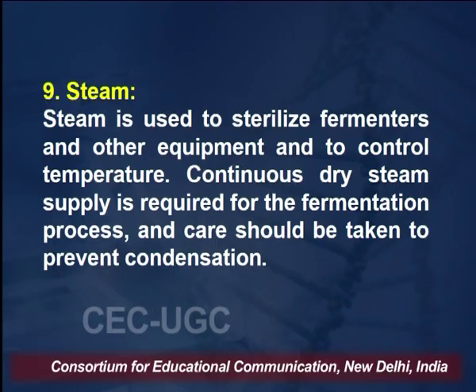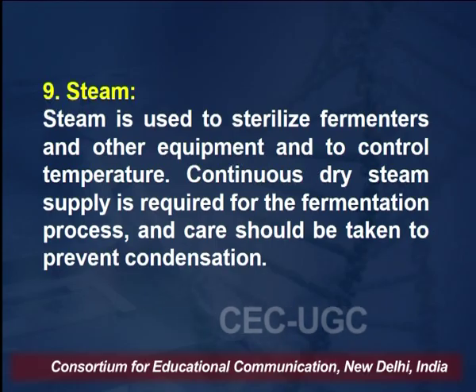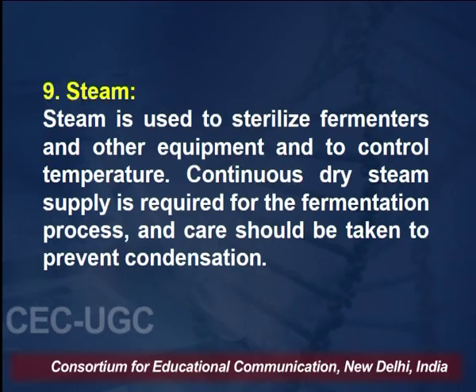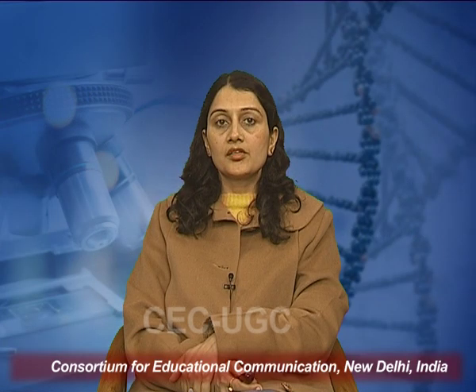Steam is usually used to sterilize fermenters and other equipment. To control temperature, continuous dry steam is required for the fermentation process. Care should be taken to prevent the condensation.